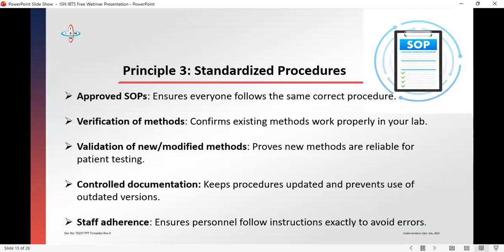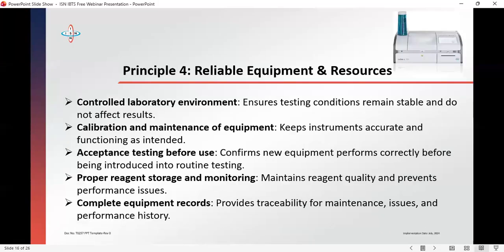So what standard operating procedures do for us is not because it is what the requirement or principle demands us to do. It is so that our work is consistent, so that even if it is a new graduate or somebody that has practiced for 20 years, we are following the same process to achieve the result. Not that when somebody disappears, the normal way of doing things will go with the person. But as far as it's documented and somebody is checking to see that everybody does the same thing and is adhering to those protocols, it remains consistent and nothing will be missed and we will continually get accurate results.